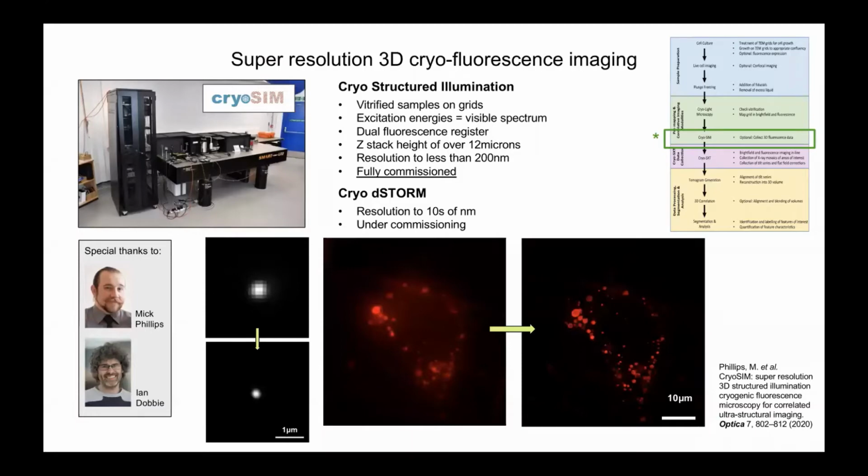So we're still working on that. And just to prove a point, I can show you a 175 nanometer bead and how it looks in diffraction limited imaging on a microscope and by applying structural illumination. And the same with a cell that you will see actually in a little bit also. I'm using it as an example.